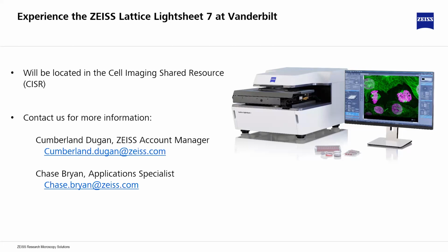Is there the possibility of switching out the camera? Let's say I have a very low signal. Could I put an EMCCD in there? As it's configured right now, we're only offering the lattice light sheet with the CMOS cameras, but I wouldn't say never, just that it's not as it's configured currently. And that's not what you'll see on campus in a couple of weeks. Well, that's the obvious choice. Yeah. But yeah, I totally understand the desire for a CCD option as well.